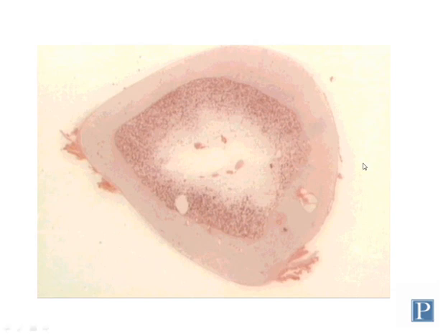This particular section was prepared using a method that's called decalcified bone preparation. You do need to know this, be able to identify what technique was used to prepare this slide if we show you this. Decalcification is when the bone is treated with acid, which helps to remove the hard calcium and phosphate salts, which essentially softens the tissue, making it soft enough to where you can section through it and then stain it. So if you see a section of compact bone that has been stained with H&E, giving it a pinkish color, as you can see here, then you know it's been prepared through decalcification.